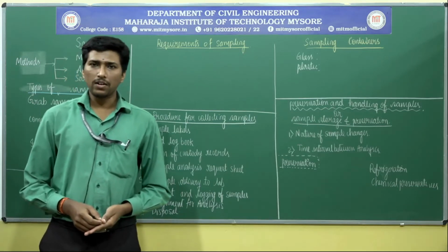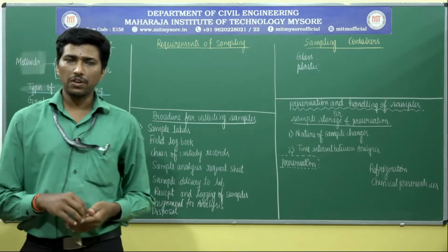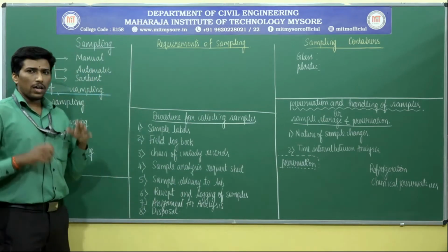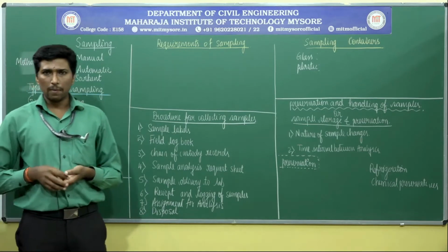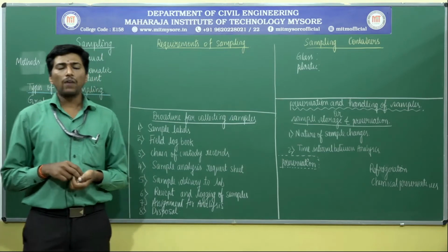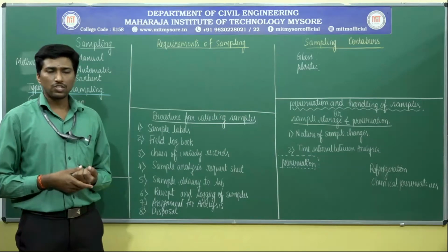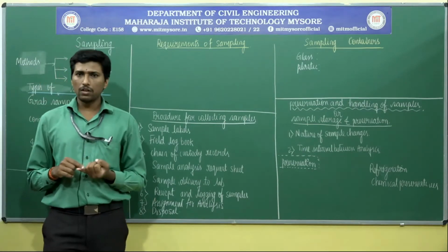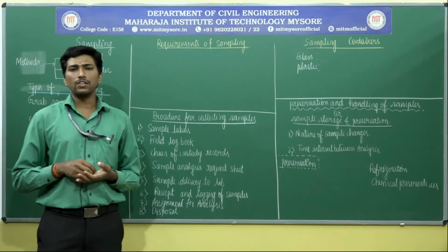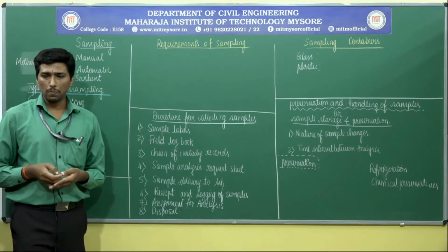So in today's part of the session, I think we shall discuss some of the concepts related to the laboratory analysis of sampling. In the laboratory analysis of sampling, what are the different types of samples that are to be collected, and what is the procedure followed for the collection, either in water or in wastewater. Okay, the theoretical principles are necessary to understand how the samples are to be collected.